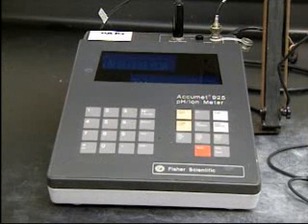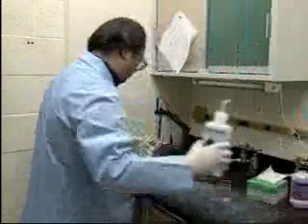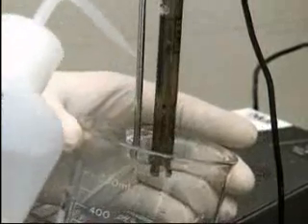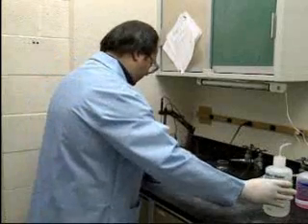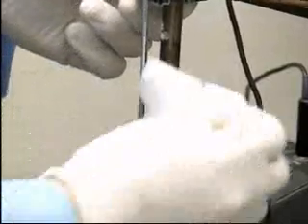Temperature can affect the accuracy of a pH measurement, so this meter's internal circuitry automatically compensates for any variations in temperature. Before a pH test is conducted, the probes must be cleaned to make sure they're free from materials that could contaminate the sample and cause an inaccurate reading. Generally, distilled water is used to rinse any foreign materials from the probes. Then the probes are patted dry with a lint-free tissue.